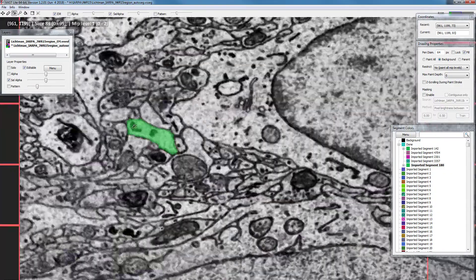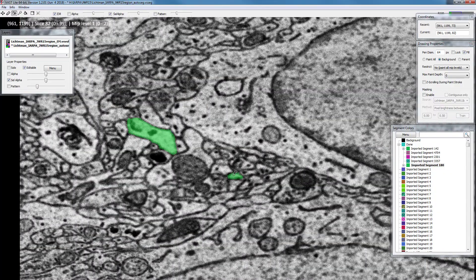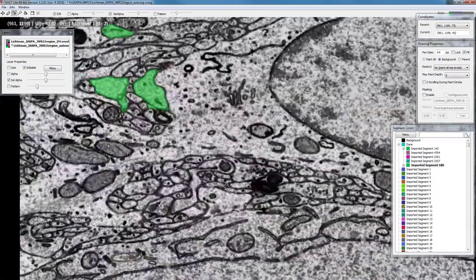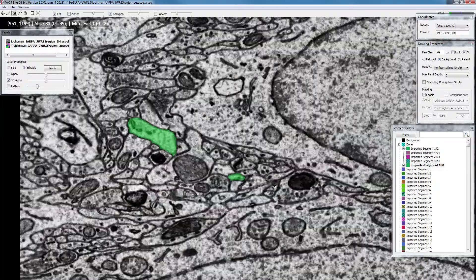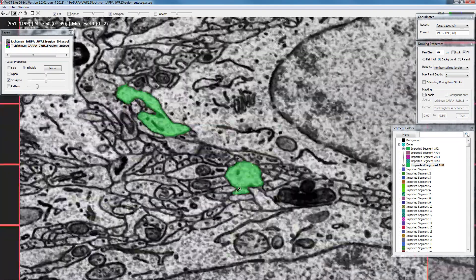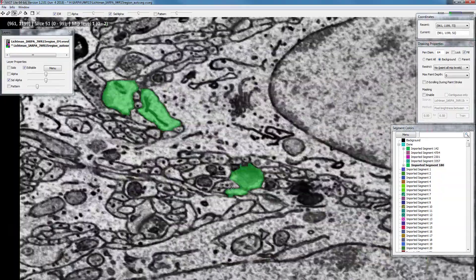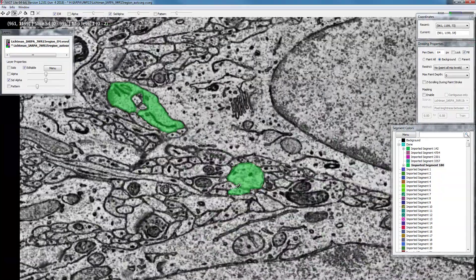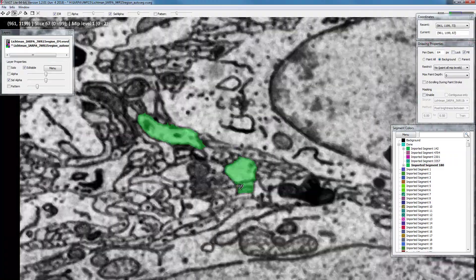I have to go through, and here is another problem — it should be continuing here. And now we have another type of problem: a merger. There's this object that comes here and then becomes green, and then it stops being green here and continues as a different object. This should actually not be part of this dendrite — that looks like an axon going by and it's not actually connected; there's a membrane between them.